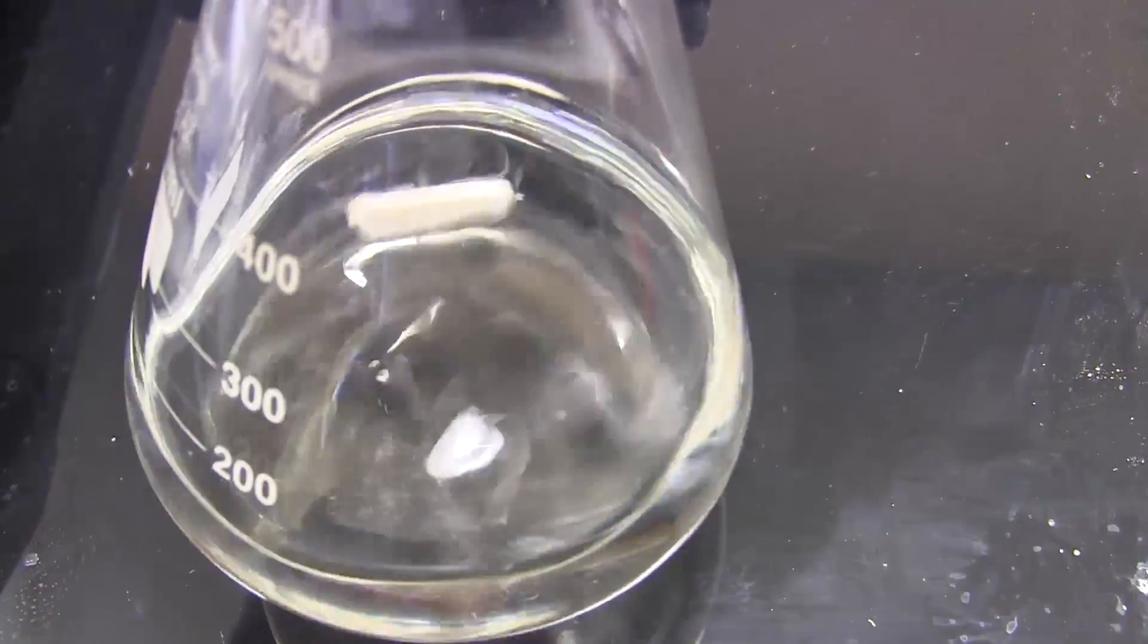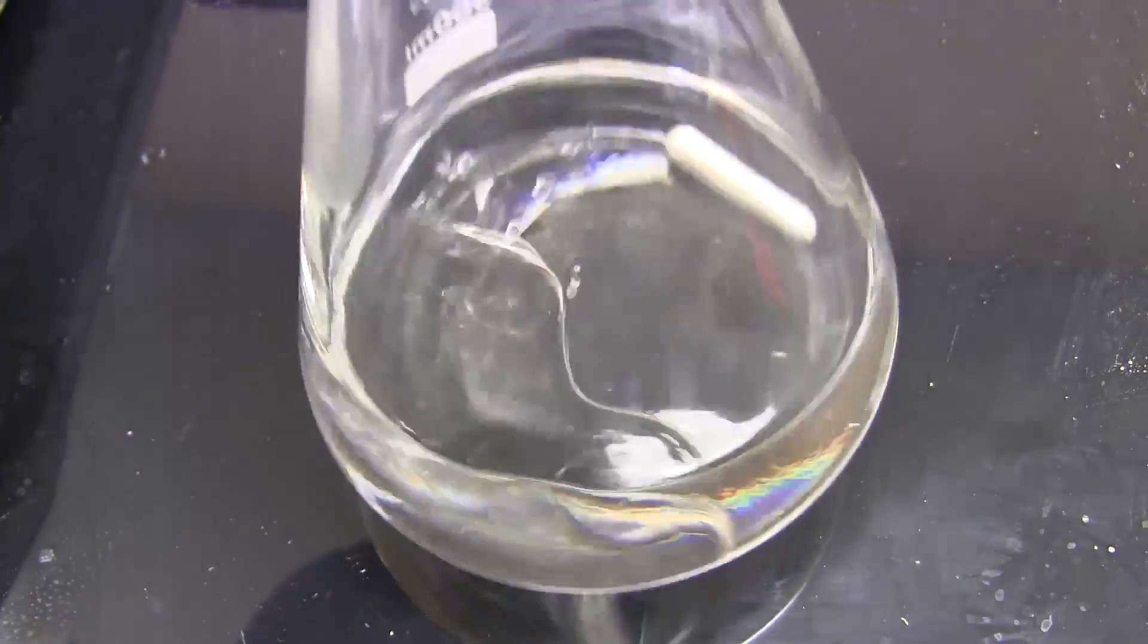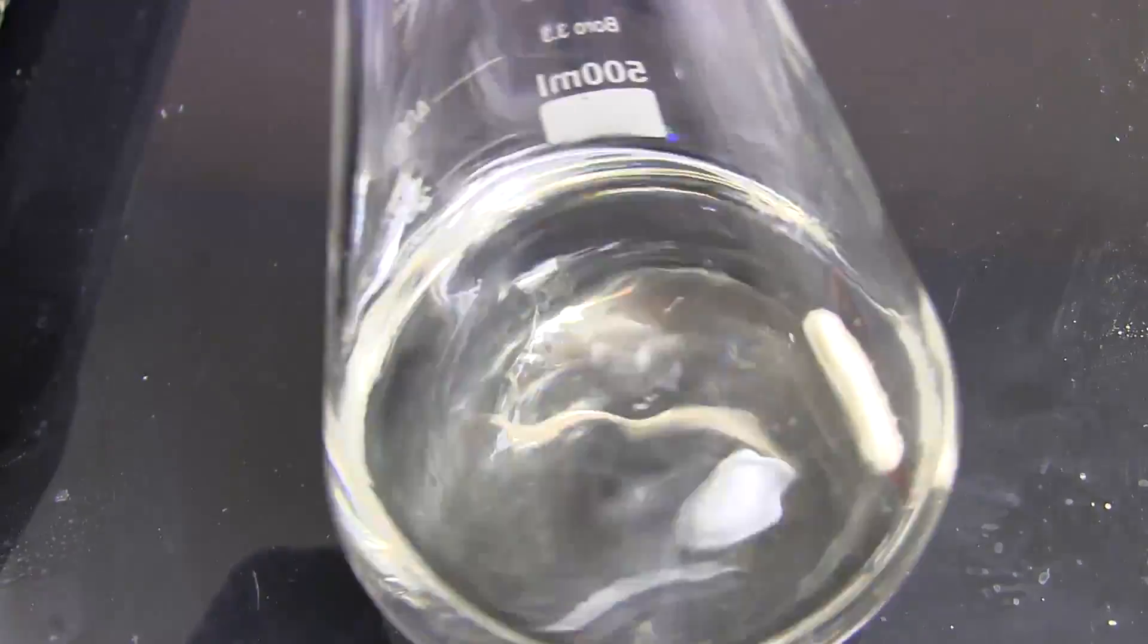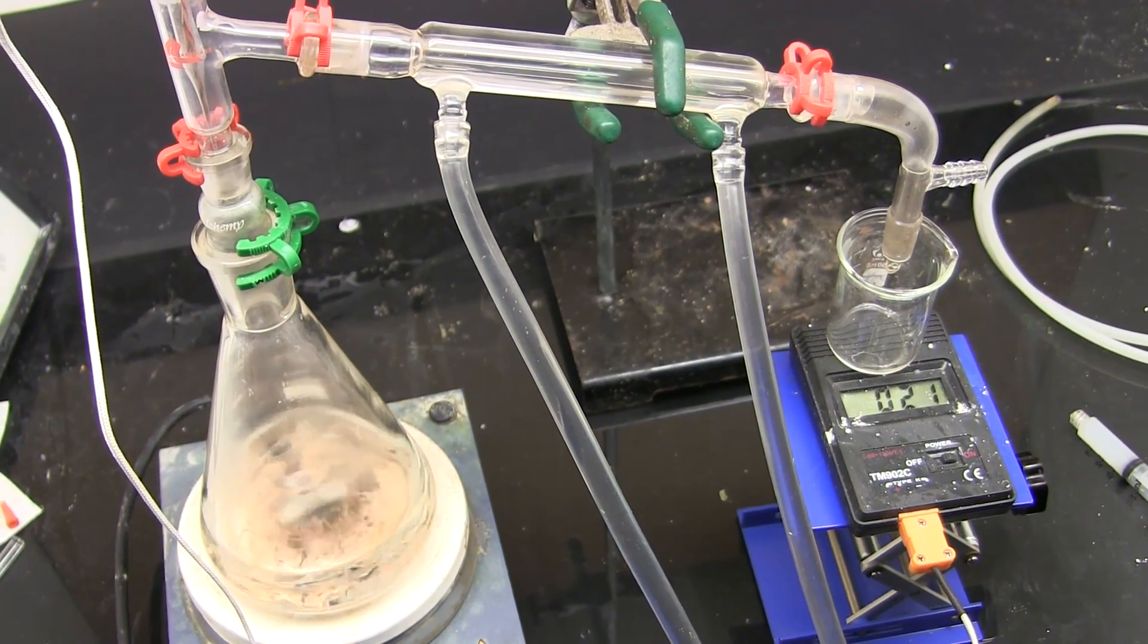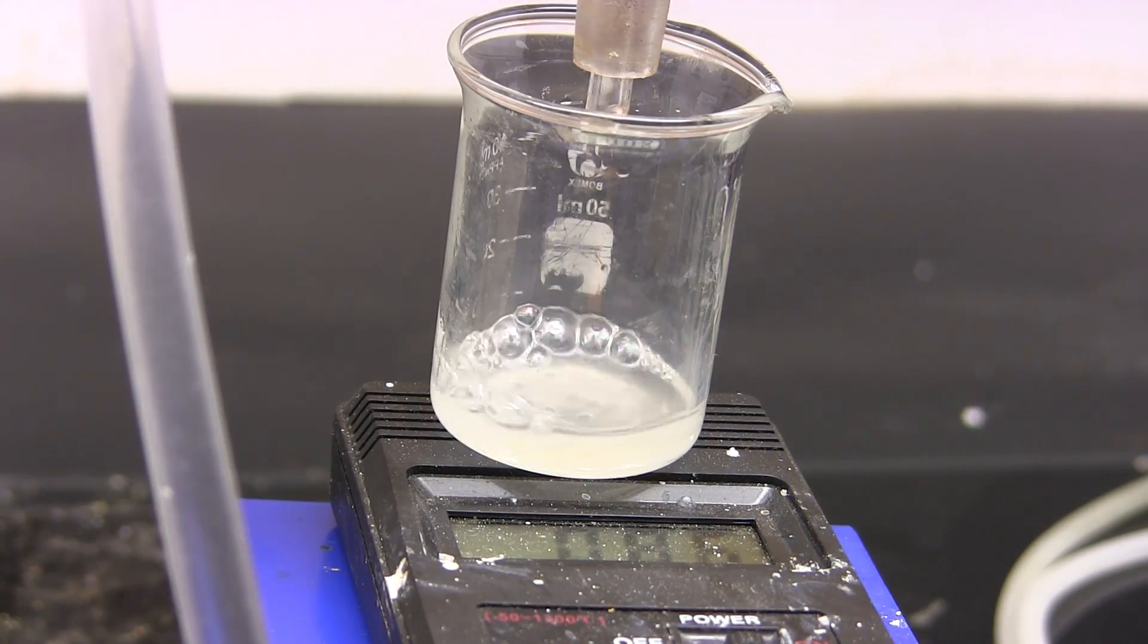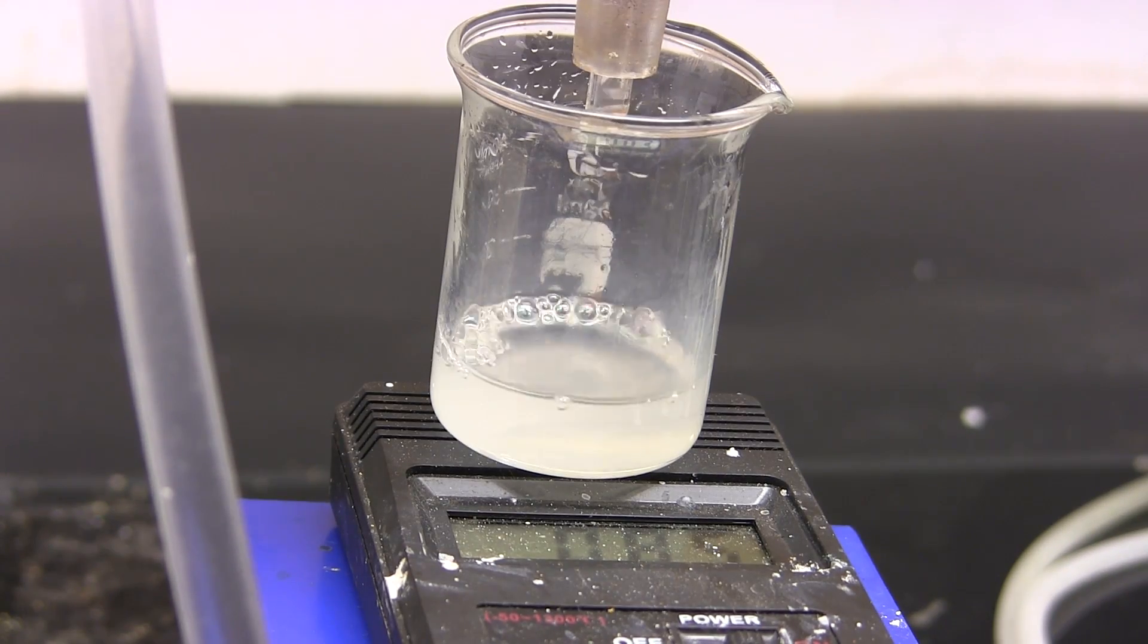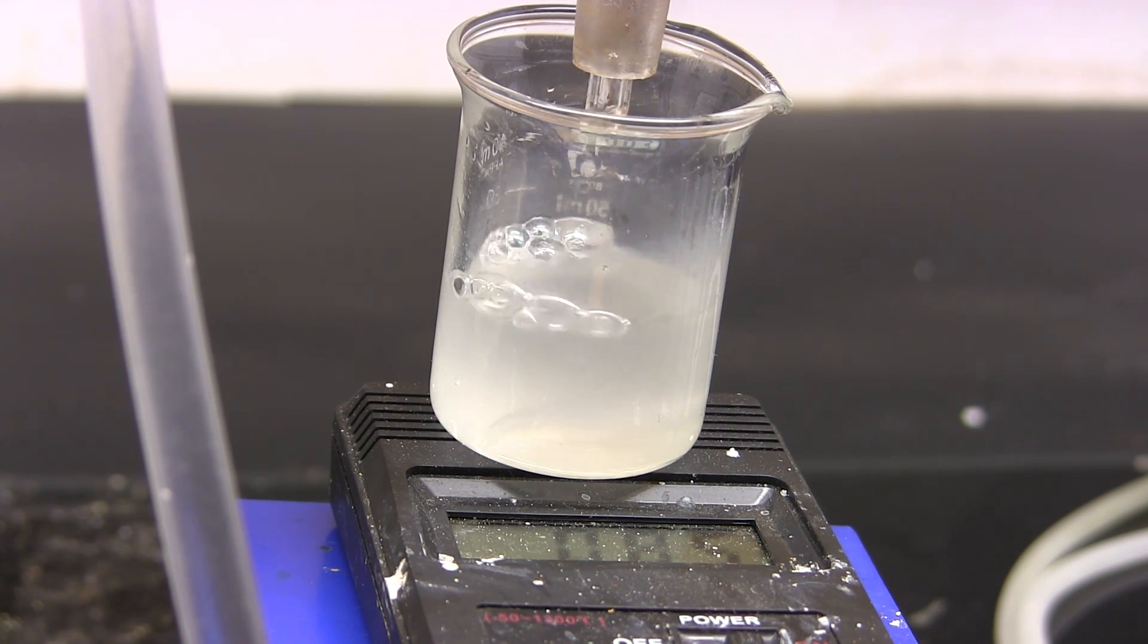Here I have a mixture of toluene and water. Toluene boils at 110 celsius and water obviously boils at 100 celsius. They don't mix very much at room temperature but if you set up a distillation and boil them, an interesting thing happens. They form an azeotrope that boils together at a much lower temperature of 84 degrees celsius. When they condense and cool they separate back into their separate phases.